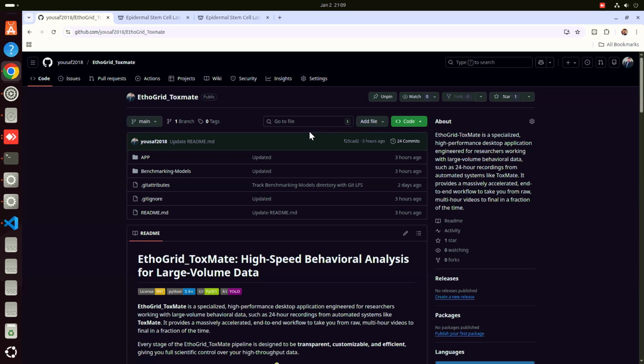Hello everyone. Today I will show a step-by-step guide on how to install EthoGrid ToxMate. So let me introduce myself.